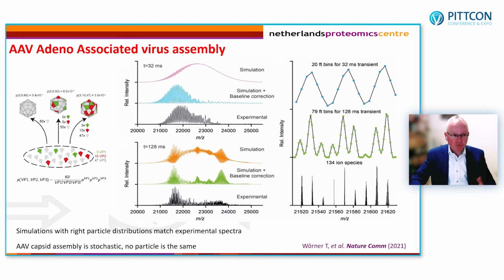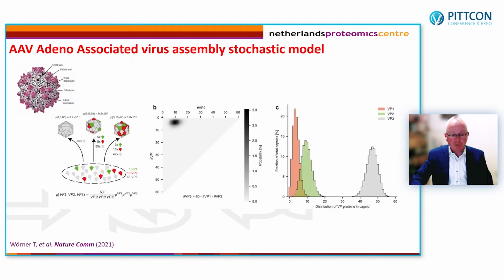Now, we think this is quite a challenge and we are quite proud that our mass analysis could analyze this. It's some of the highest resolution mass spectra of virus particles that we have ever measured. But it's also biologically relevant. We've learned now that the assembly mechanism of this important gene delivery vector is really random, stochastic. So what is then the nature of each particle? Now, this is given here on this slide, and maybe I just want to show you here, totally on the right.